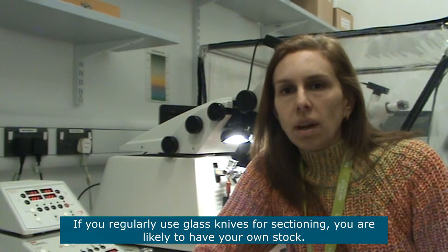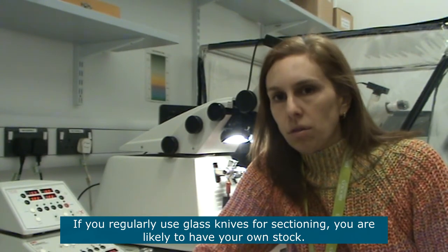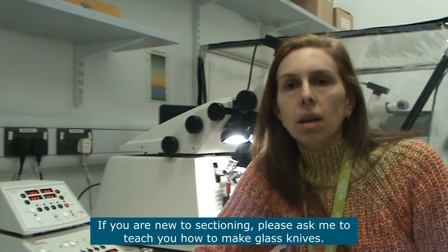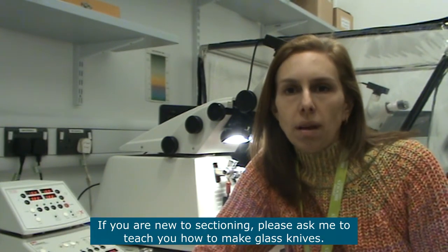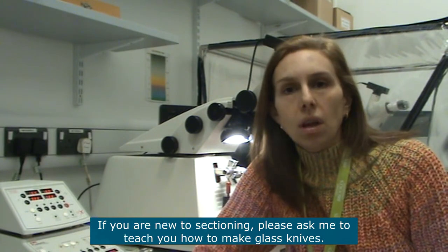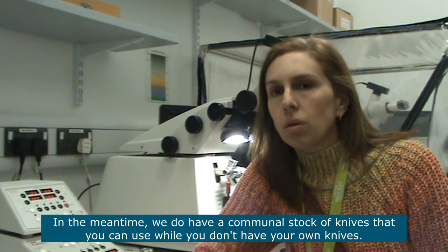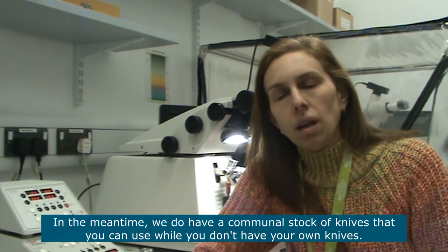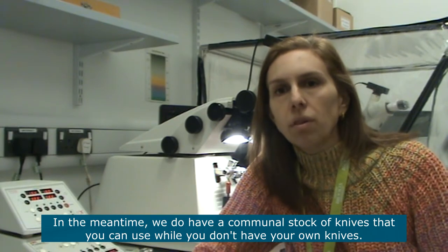If you use glass knives regularly for sectioning it's likely that you have your own stock of knives that you've made. If you are new to sectioning, please ask me how to make glass knives so that you can have your own stock. In the meantime, we do have a communal stock of glass knives that you can use while you still don't have your own knives.